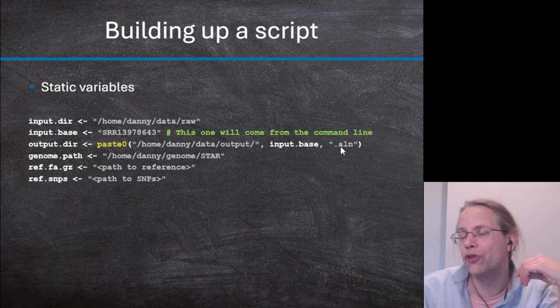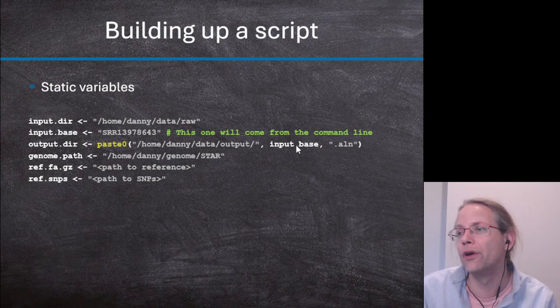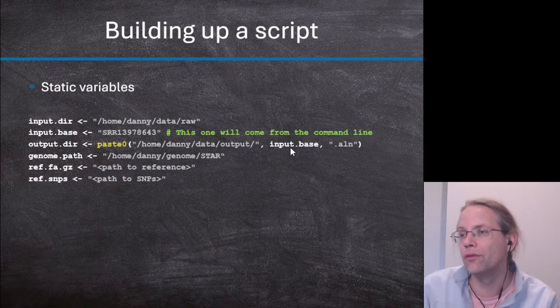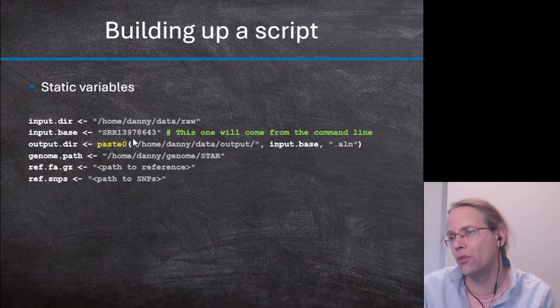Right, so this is just going to be a directory, and this directory is going to be in the output folder, and then all of the files from SR139 blah blah blah will go into SR139 blah blah blah .aln for alignment.